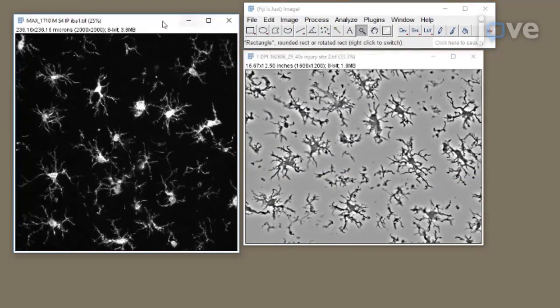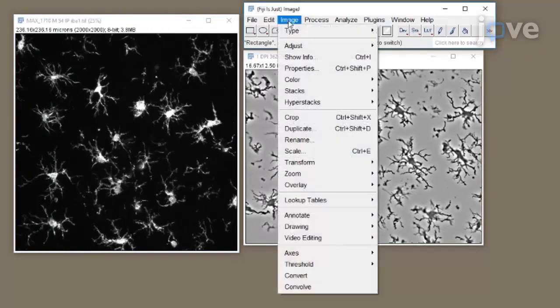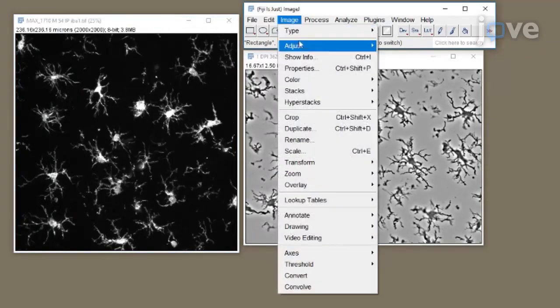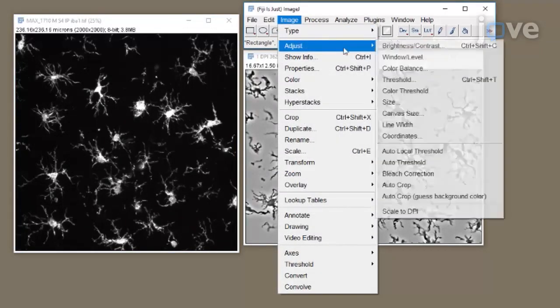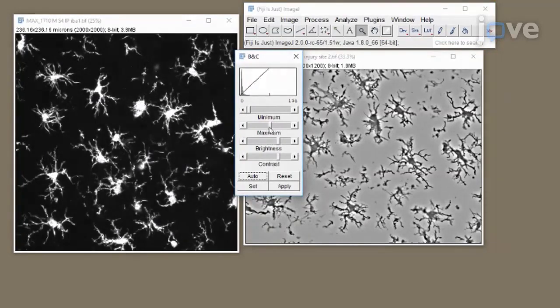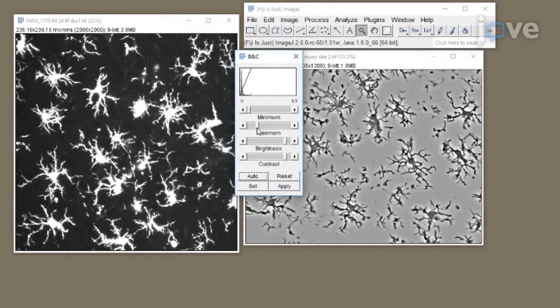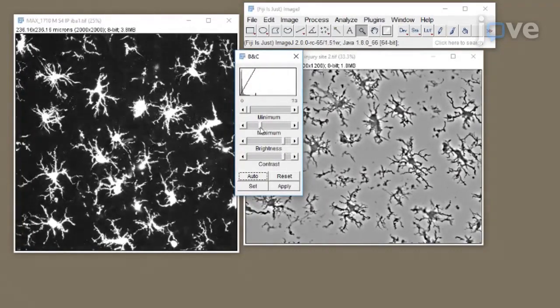If the image is too dim to visualize the processes of the microglia, use the toolbar and click Image, Adjust, Brightness/Contrast. Adjust the minimum or maximum sliders, as needed, up to the edges of the histogram, but no further.